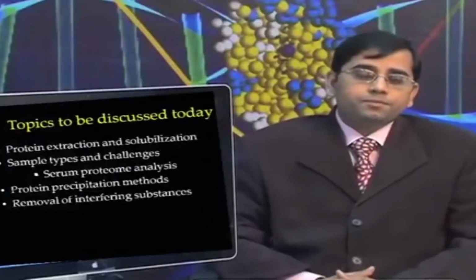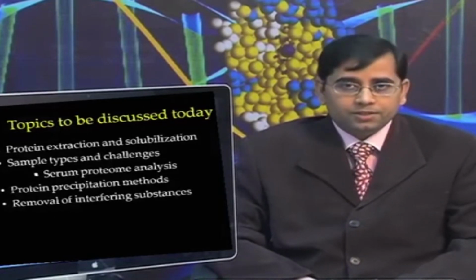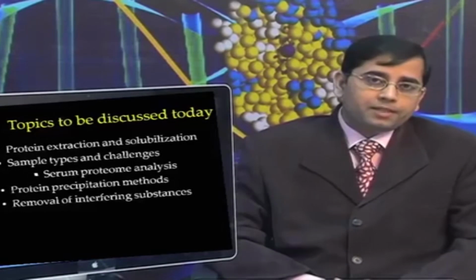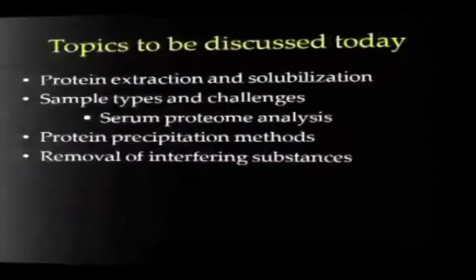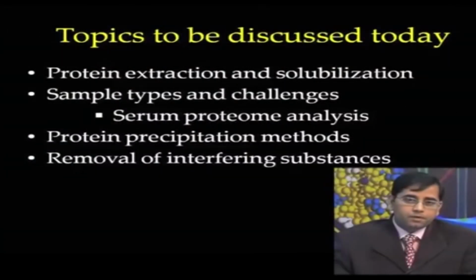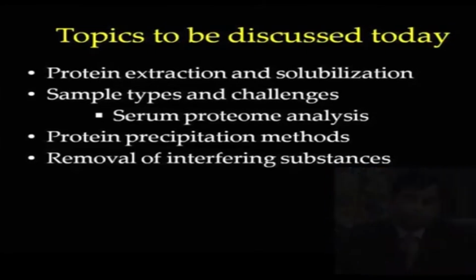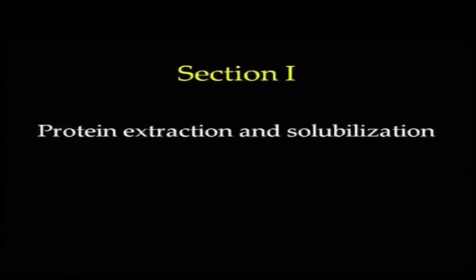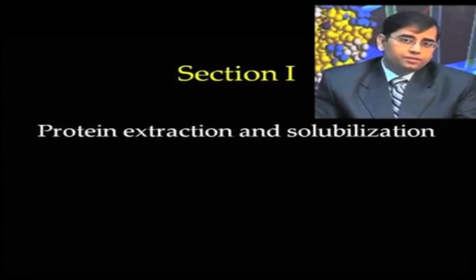In today's lecture, I will first talk about protein extraction and solubilization, and a few precipitation methods which are commonly used for different types of protein sample preparation. Then we will talk about the removal of interfering substances. Let us talk about protein extraction and solubilization.